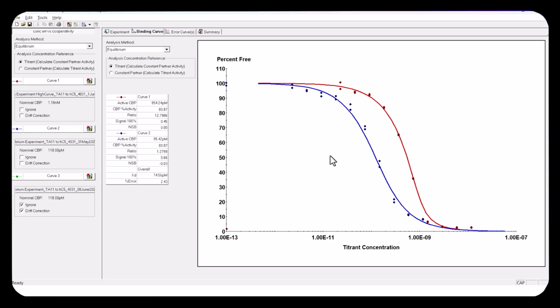It looks kind of periodic. It could be sinusoidal. It's high, it's low, it's high, it's low, it's high. So I don't trust this. And another way to say that is the data looks like it's too steep for the theory. You can see, if you imagine connecting these points, the midpoint of all these together, that the curve is going to be steeper than the theory curve here. So the data is steeper than the theory curve in this case.